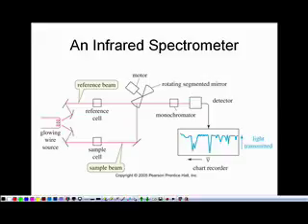The spectrum will usually go from about 4,000 wave numbers to about 600. You'll see that when you look at some example spectra. There are other parts of the infrared region that we don't have the instruments for, like Raman and some near-infrared techniques, but we're just going to deal with the straight organic infrared. So that's how the instrument is laid out. Now, let's see if this works.